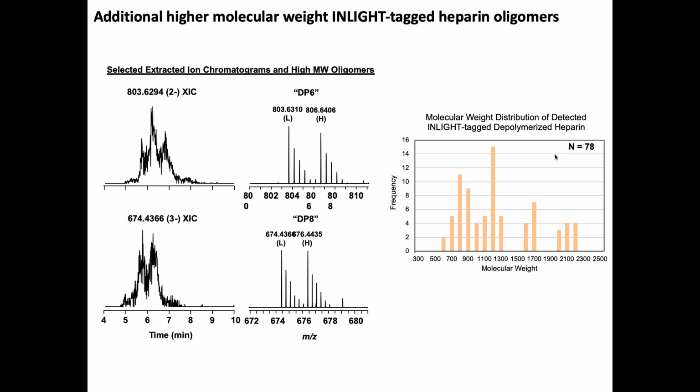so if you want to do site localization of heparan sulfate and chondroitin sulfate, for example, you could selectively enrich everything with some kind of anion exchange column to enrich all those things that have so many sulfates on them. Get rid of everything else, digest all of the heparan sulfate and chondroitin sulfate proteoglycans, chop them up with trypsin, and then you can say, all right, here are my samples. I'm going to split them. One sample I'm going to treat with chondroitinase, and then I'm going to run that by mass spec.